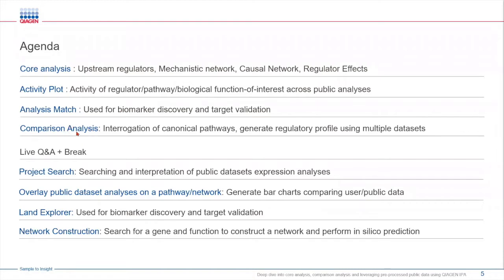Next we'll perform comparison analysis between two experimental groups to identify key pathways and regulators.